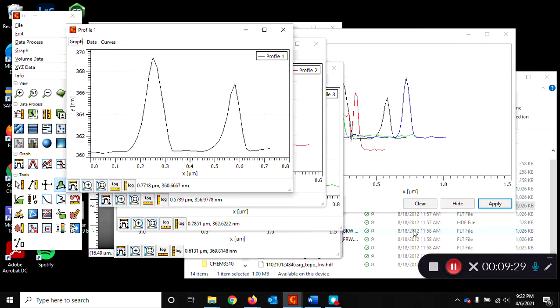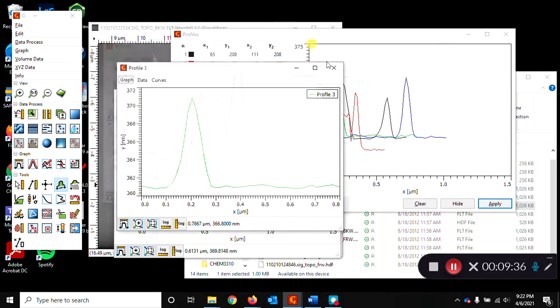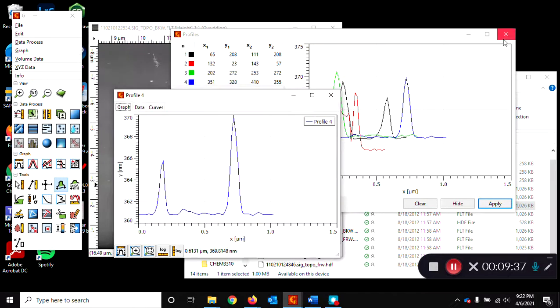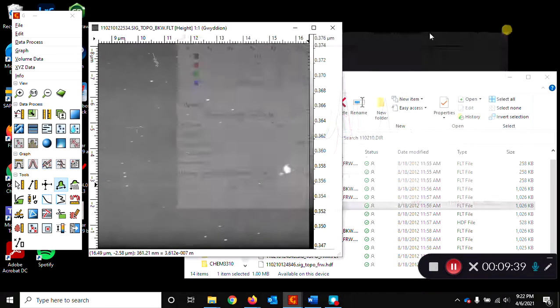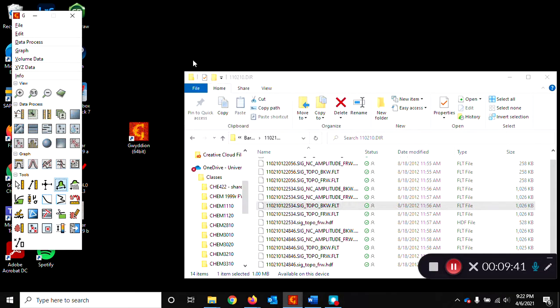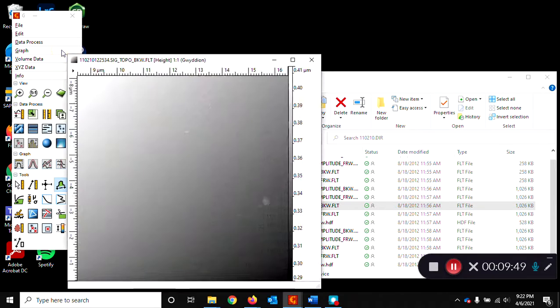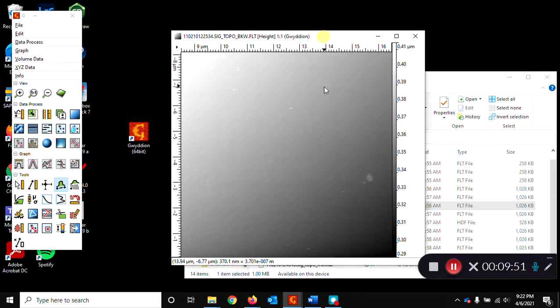You can just close all when you're done. You can just close all this out, and the original file should remain unchanged. Yep, so we went back, pulled up that file, and you're starting over on the analysis.